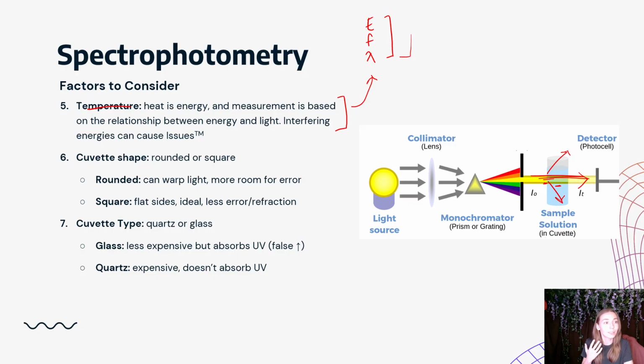And the rule that I need you guys to understand is that computers are stupid. Computers are so stupid. They only know what you tell them. Okay. And so if I have light getting absorbed by my glass, and I have light getting absorbed by my specimen, the computer thinks that all of that light is being absorbed by that specimen because we haven't told it that light is going to be absorbed by the glass. All that it knows is that all of a sudden there's less light making it through to the end of the system, which means that more of it got absorbed, but it assumes that all of that increased absorption occurred within the sample. That's a problem. We don't like that, okay?